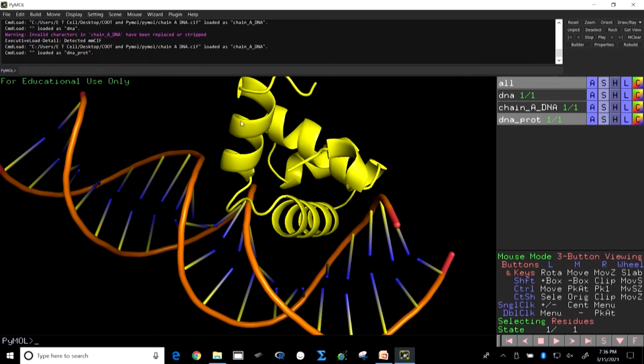So, this is a typical super secondary structure motif. You remember when we were going through the protein structure, protein domain, I talked about super secondary structural domains which help you to understand the function directly.